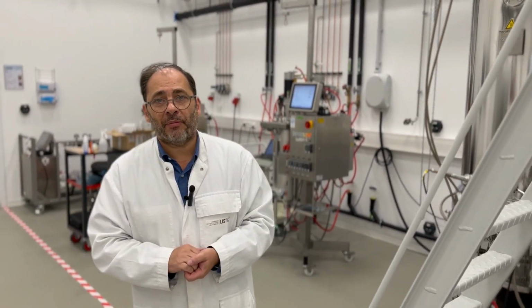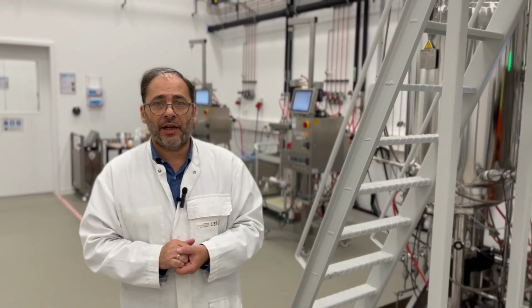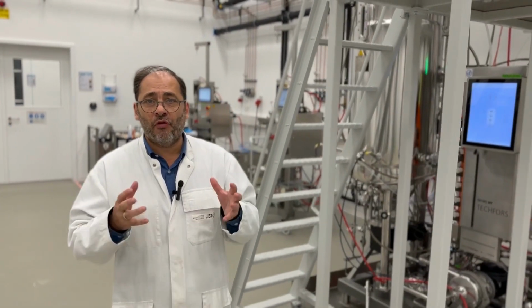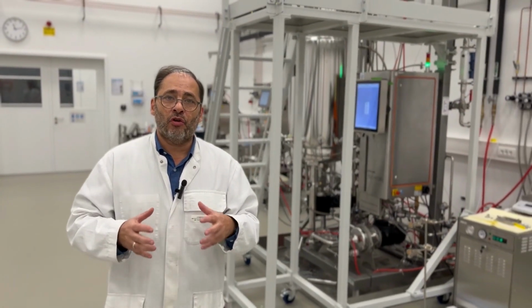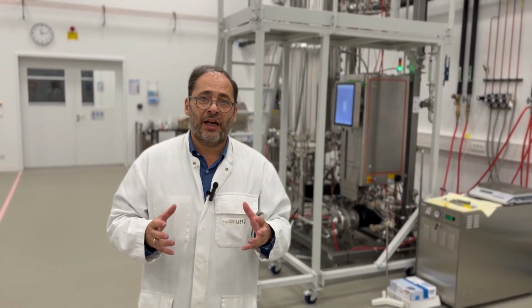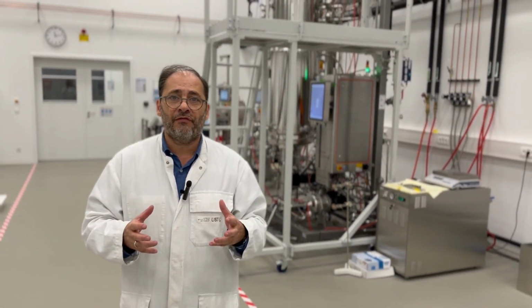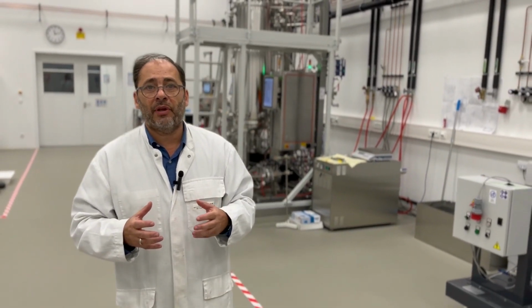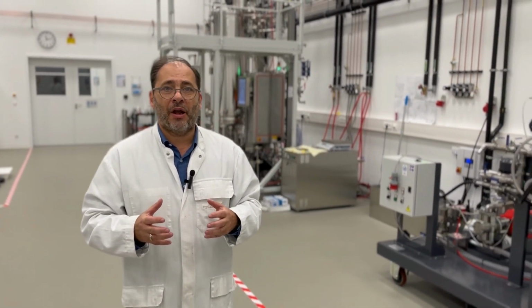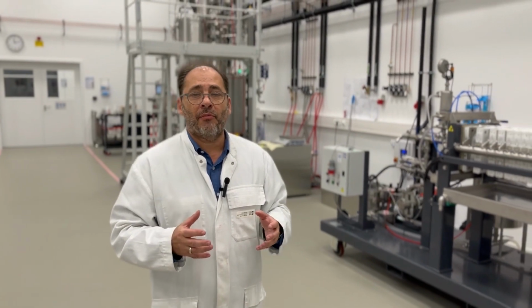The future of bioseparation technology and downstream processing lies nowadays in a full integration with the whole bioprocessing train. On top of that, we are adding a digital layer to it, so digital twinning, for example, in order to create more robust, sustainable, and profitable bioprocessing scenarios for the modern industry.